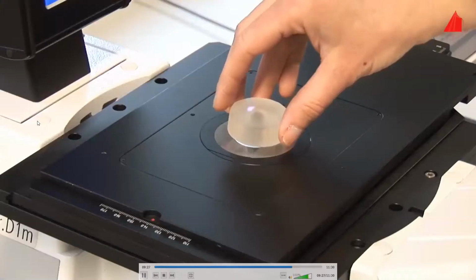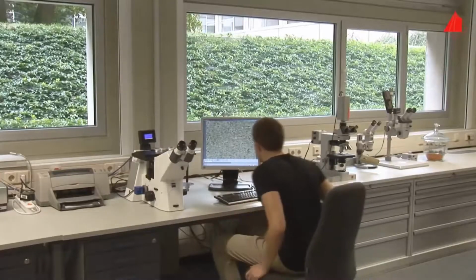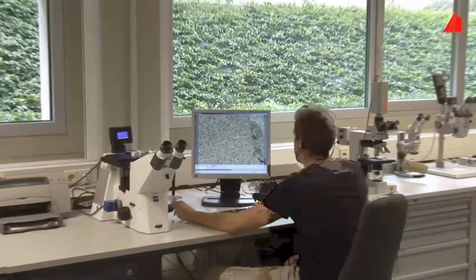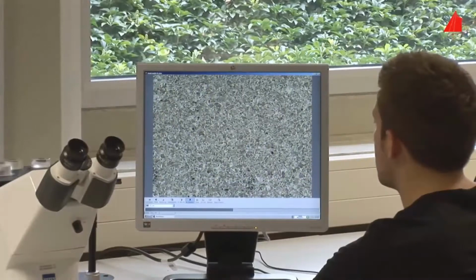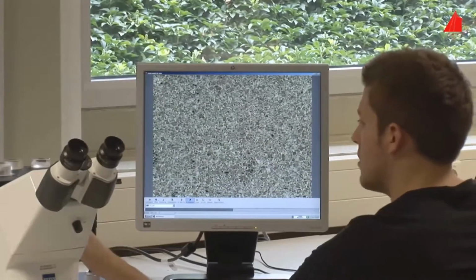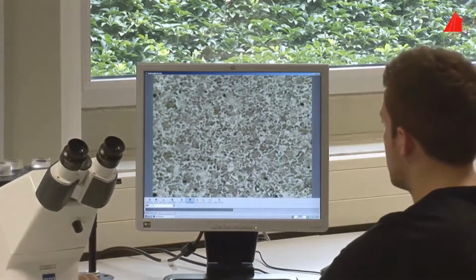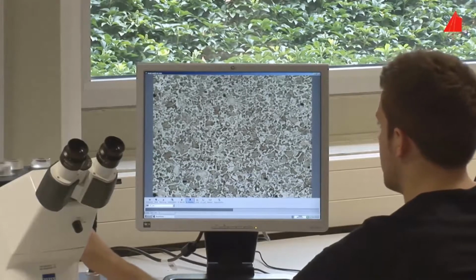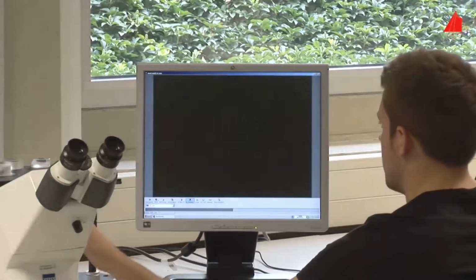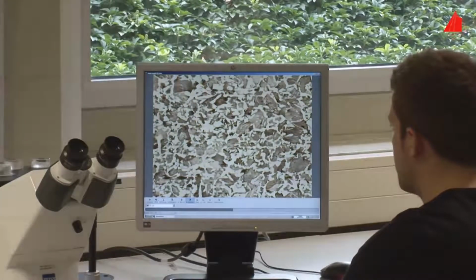The excitement increases. Was the etching time correct? Has everything worked out fine? At low magnification, not much can be seen, which looks characteristic. The tester gradually switches over to higher magnification. In between, he focuses and adjusts the brightness. At medium magnification, light and dark areas become visible. At comparatively high magnification, in some of the dark areas, fine stripes may be recognized.